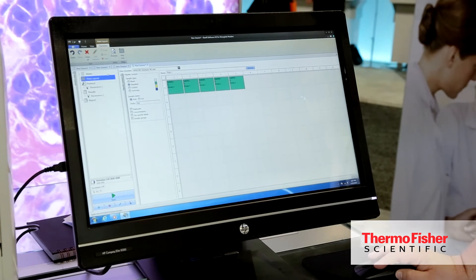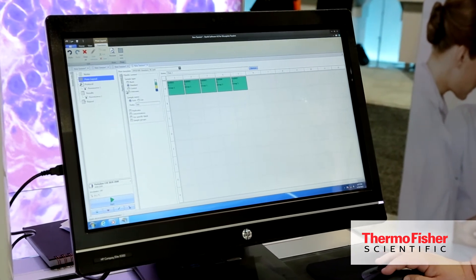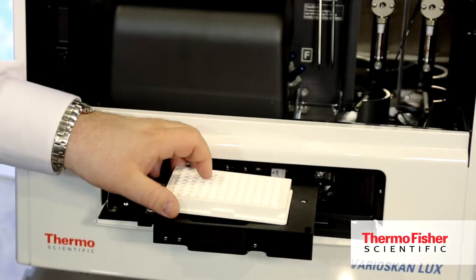The instrument comes with Scanit 4.0, which is new software for all of our microplate readers including the MultiScan GO and the MultiScan FC. It can accommodate 96 up to 1536 well plates.